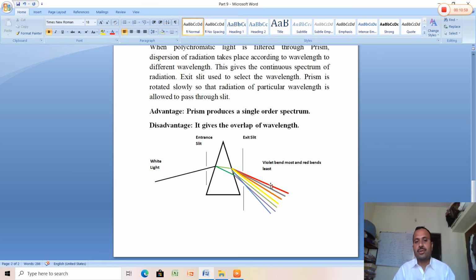So this is all about the basic principle of the filter. What is the principle of filter, why it is used, and what are the differences between the filter and prism. That is the most important, and this lecture will give the idea about all this.